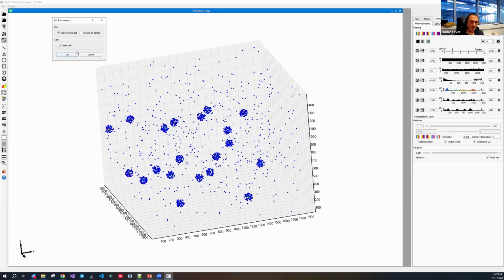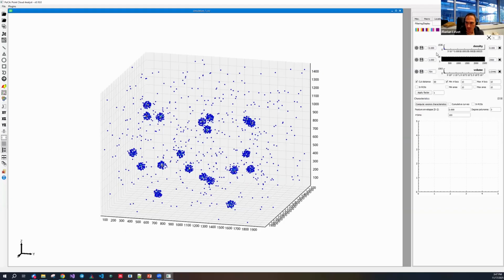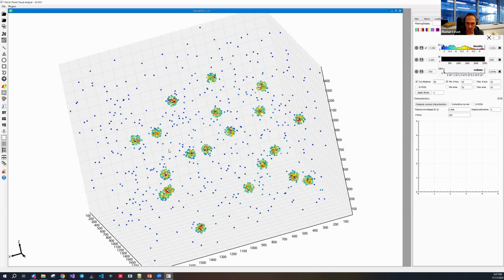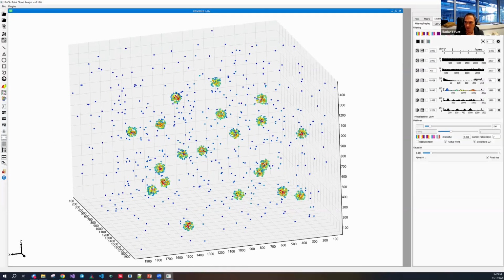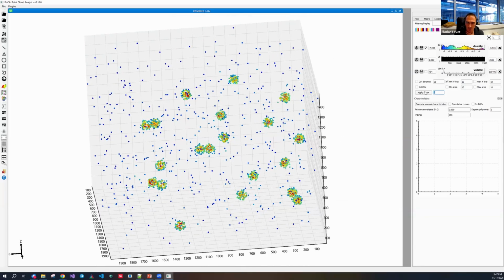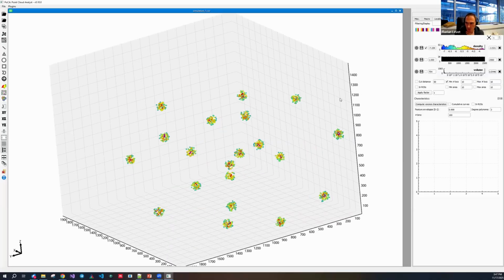So it's not done directly because the process that is used in order to compute the volume is a little different on the GPU. We are not creating exactly the cells. If you want to create them, it's a process that is done on the CPU, so it's a lot longer than creating the cells on the GPU. And here you can see still that you have the density that was computed. We can put it as a logarithmic distribution, and then here you have the density of the localizations, and now you can apply a factor, as I said before, in order to do the selection of the localizations that you want to keep in order to create the objects.